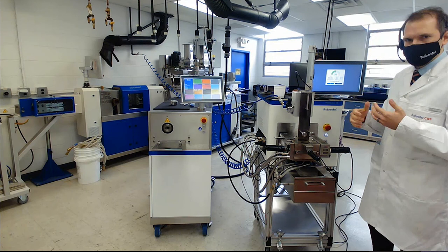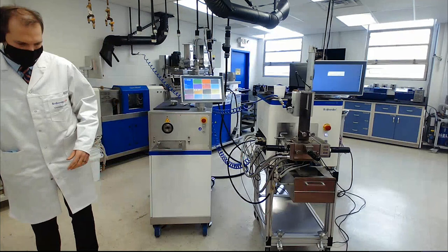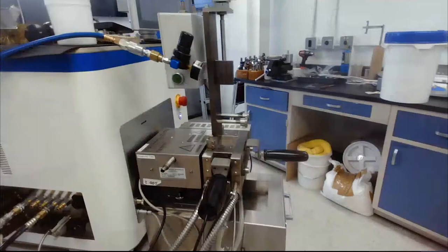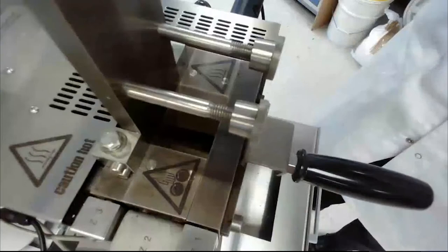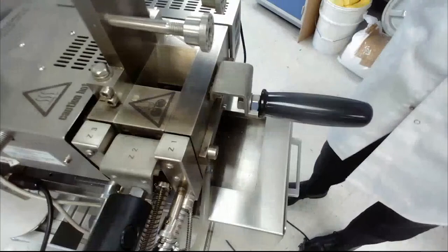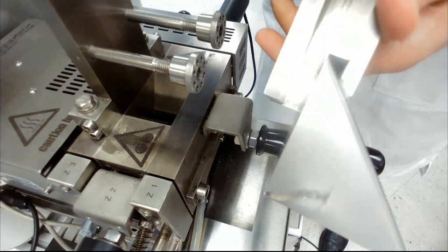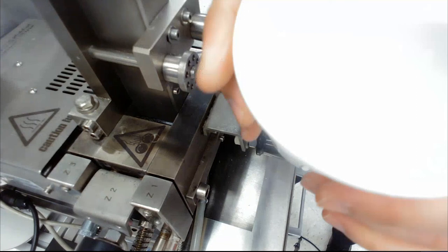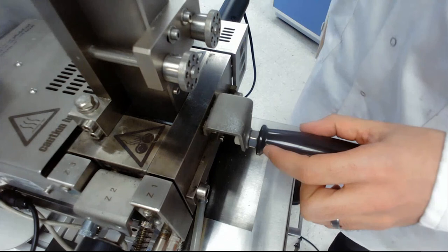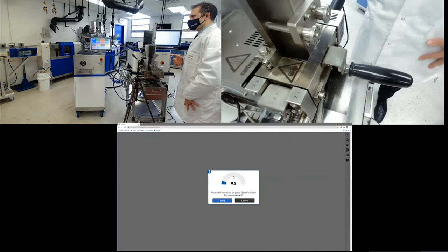The start button is pushed. I will get you another camera as a close-up. You can now see that the blades are spinning at the moment, it's calibrating itself waiting for the input. I have our pneumatic load chute as a reduction of bias. This is a split system that you can add to the system without creating a big heat sink. Since the mixer is running and awaiting, here's my sample, 55 grams of rigid PVC formulation. We just fill it in as we fill it in, I press the buttons here on my pneumatic load chute.